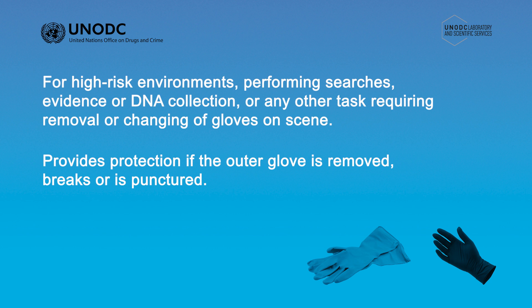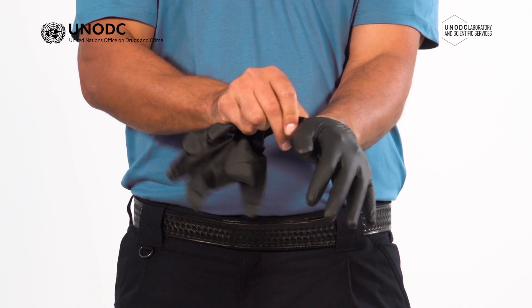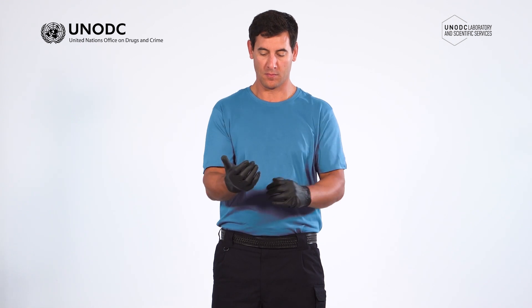To double glove, you put the gloves on in the same way you do for a single pair. Before putting the gloves on, always undertake a visual inspection for any defects or damage. Insert your hands into the first pair of gloves as you normally would. Make sure the gloves are on properly and the cuff is fully extended and not bunched at the wrist.